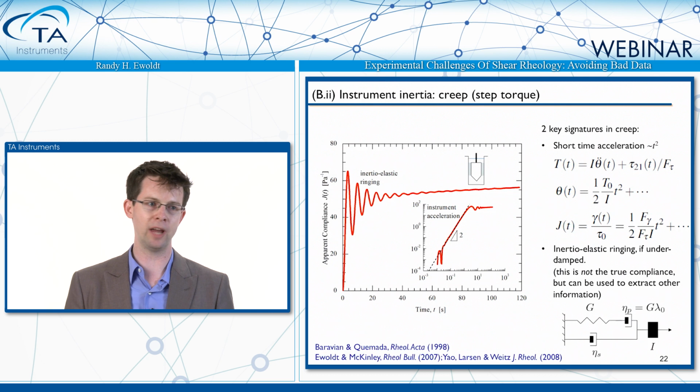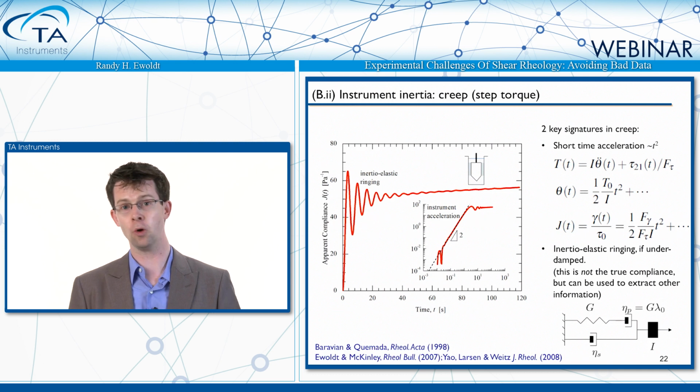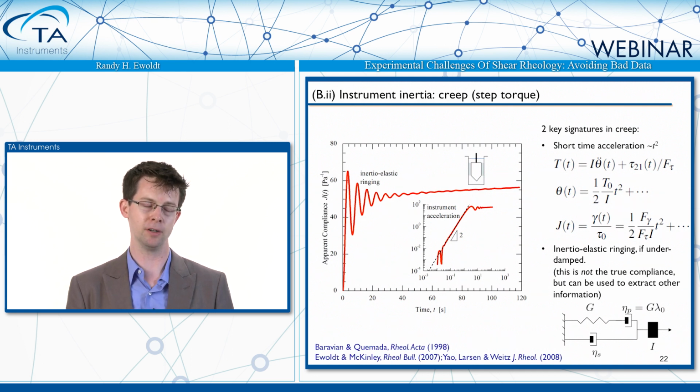When you see that data, you don't have to ditch it and kick it out necessarily. There are ways to extract useful information from that data. It's not the leading order thing you'll probably do if you're new to rheology, but if you've been doing this for a while, you might be comfortable going in and fitting other equations to the ringing to get more detailed information about your system.